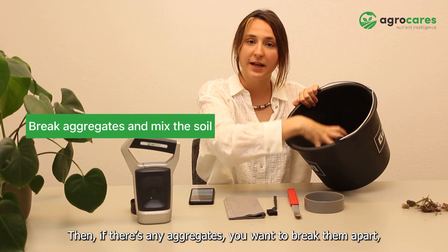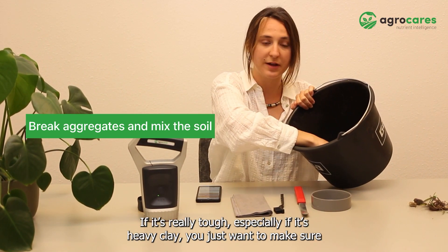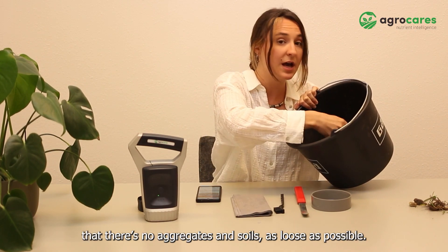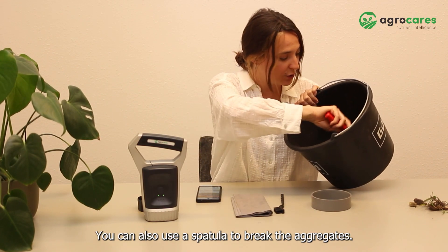Then if there are any aggregates, you want to break them apart. You can use your hands if it's really tough, especially if it's heavy clay. You just want to make sure that there are no aggregates and the soil is as loose as possible. You can also use a spatula to break the aggregates.